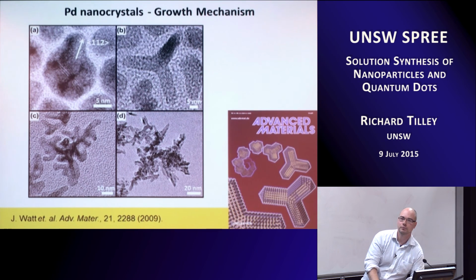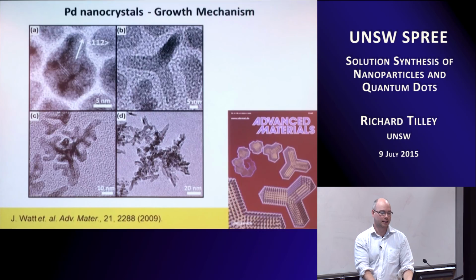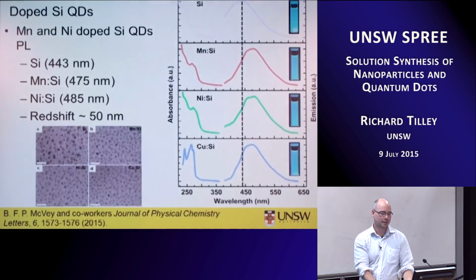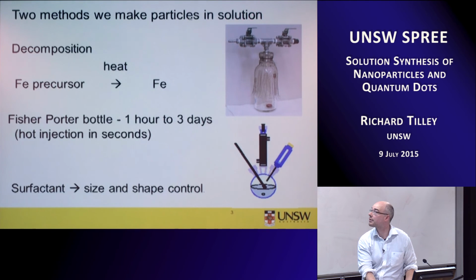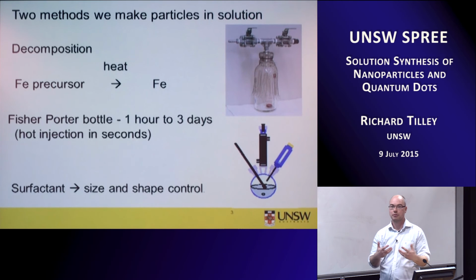If you put a metal in there like nickel or manganese, do you have an additional precursor in there, or do you just put a gaseous precursor in? We put in a solution, so it's a liquid precursor. It's a bit hard to see in this picture, but essentially you've just got a little solution there. In that solution there's our solvent, which is dissolving our organometallic precursor, and then the surfactants are in there as well. Sometimes the surfactant can bind to the metal before it's even reacted or reduced, so the surfactant choice can have an effect on that side as well.